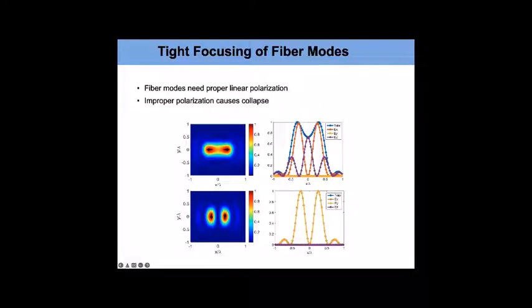So you're forced to have polarization in this direction, so that when you're using tight focusing like a 1.4 NA, you'll still get that null in the center. That's why you have to use circularly polarized light for STED in the traditional way. When you're using the vortex phase, it has to be circularly polarized. If it's even slightly not circularly polarized, you'll get some intensity in the null of the donut, or the donut hole, whatever you want to call it. Super clear, thanks. I should have just waited a slide.